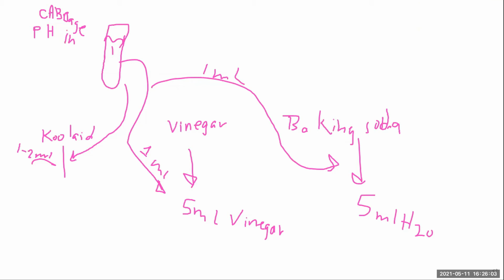So I have to do it again because that's what we have to test, right? With the test strips? No, what you need to test with the test strips is your Kool-Aid. You want to test your Kool-Aid, you want to test vinegar, and you want to test baking soda. That's different. So solution 1 is what I'm testing. Yes, your solution 1.